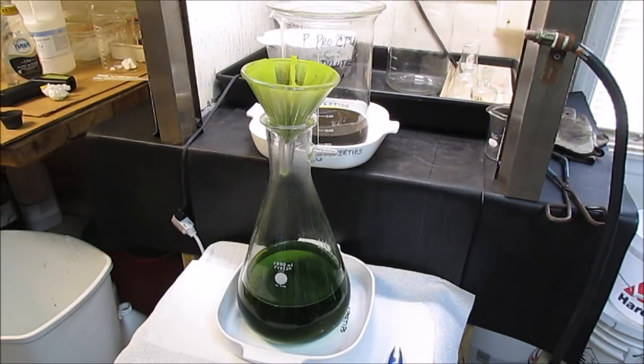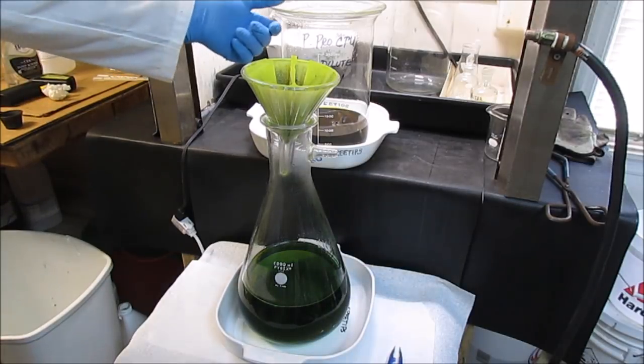Now I'm going to pour the solution off out of the beaker back here through the same filter paper and try to collect all the residue so we can refine it.